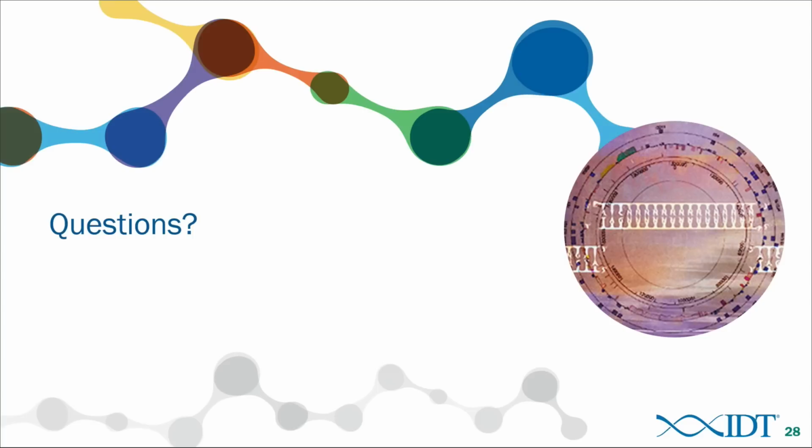Sorry, the other component of that, with the mRNA. Yes, with the mRNA, we have some beta test sites that have looked at that. We have also looked at it internally, but not to a degree that we can make any sweeping statements about it. But our beta test sites have had success using the Alt-R RNAs with Cas9 mRNA.